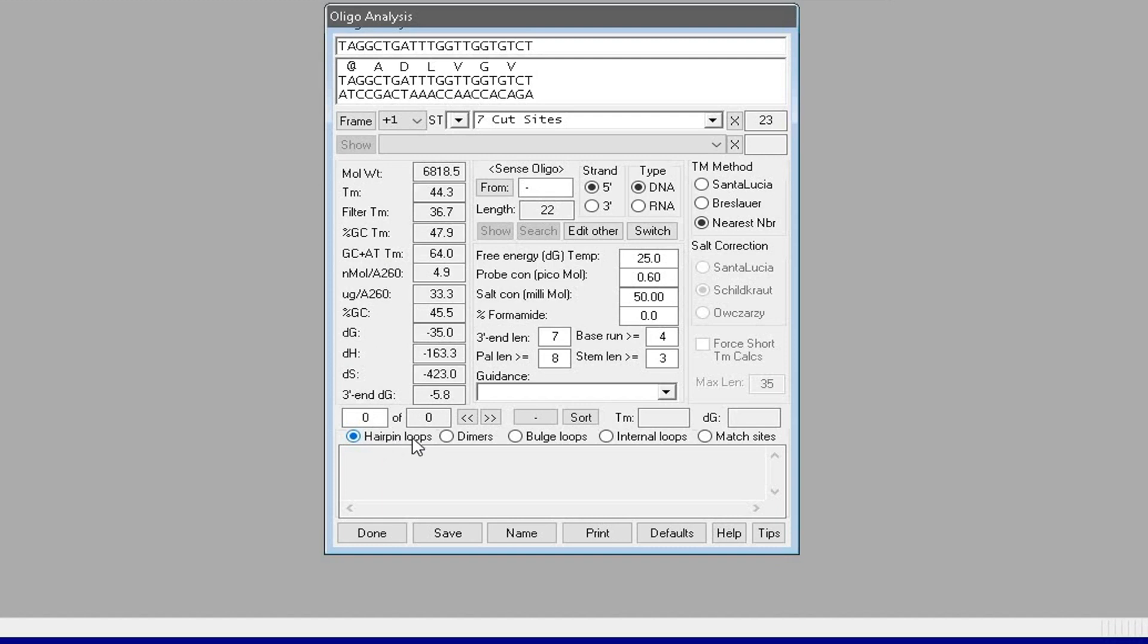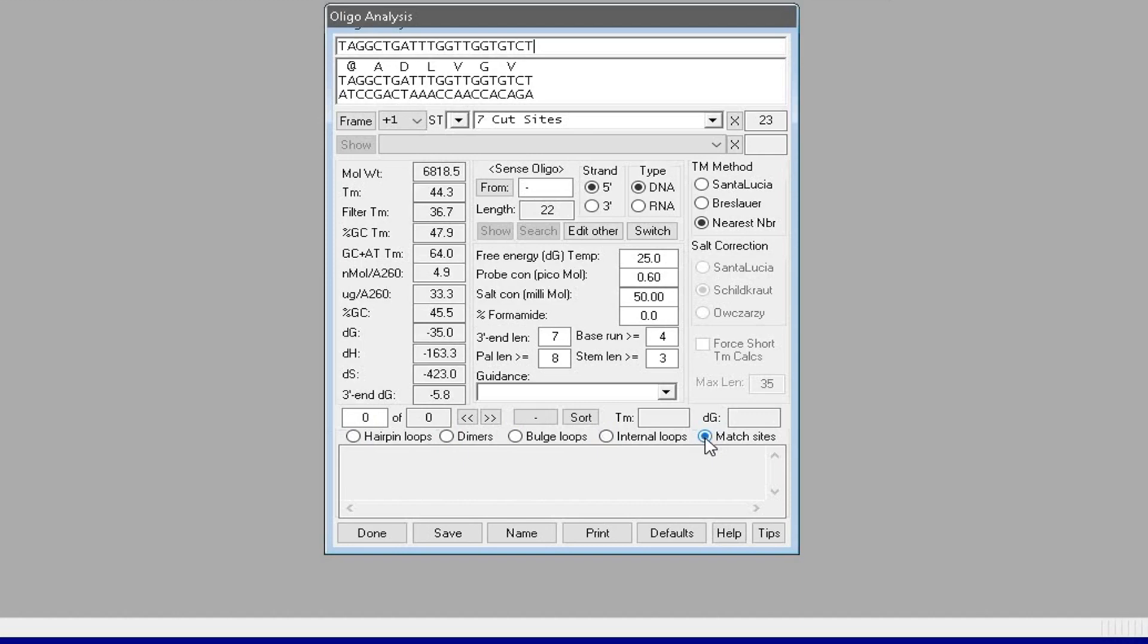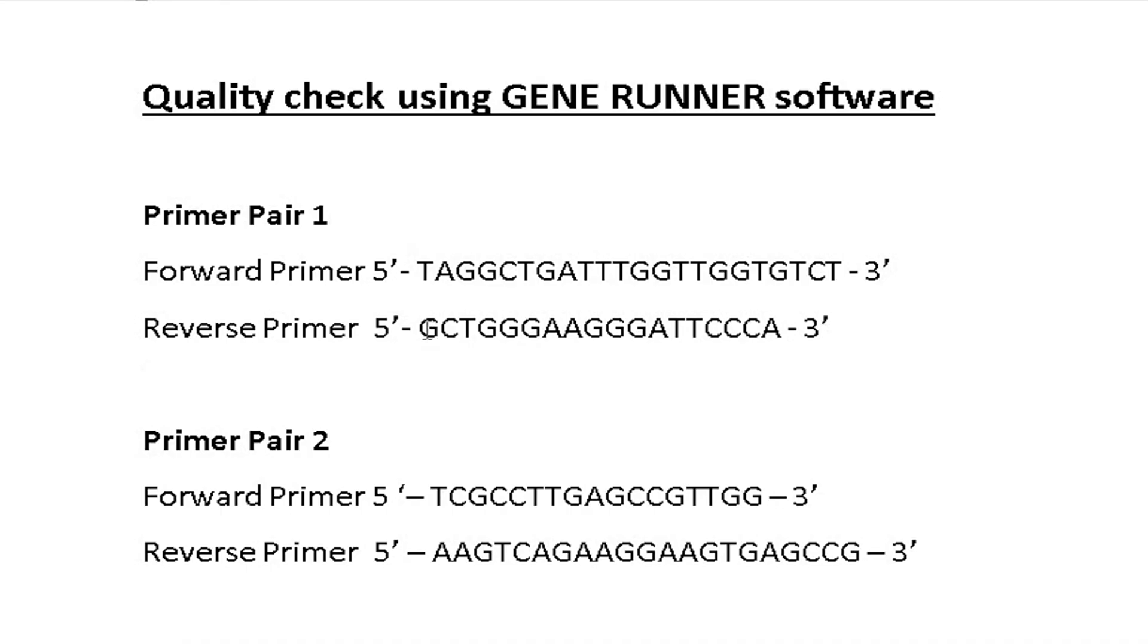For this primer sequence, no hairpin loops are detected by the software. A further check on the other properties shows the absence of any dimers, bulge loops, internal loops, or match sites. Thus, this primer sequence seems of great quality.